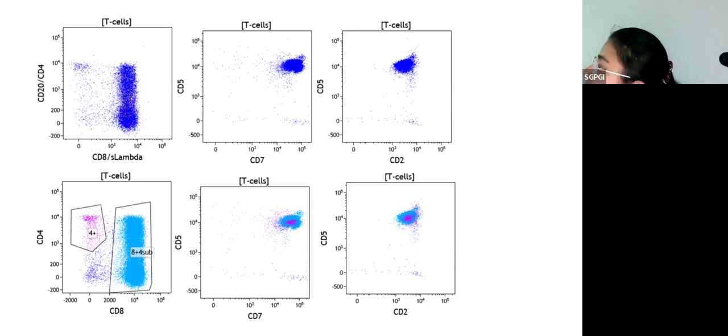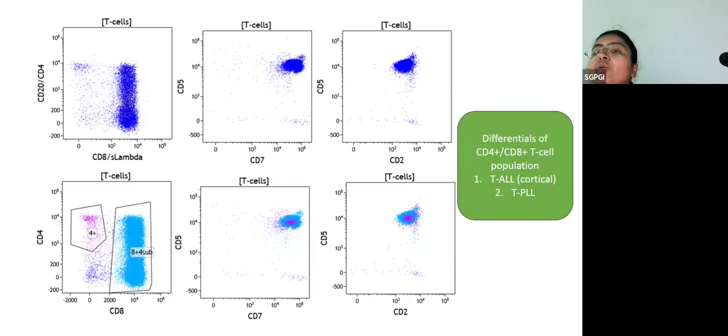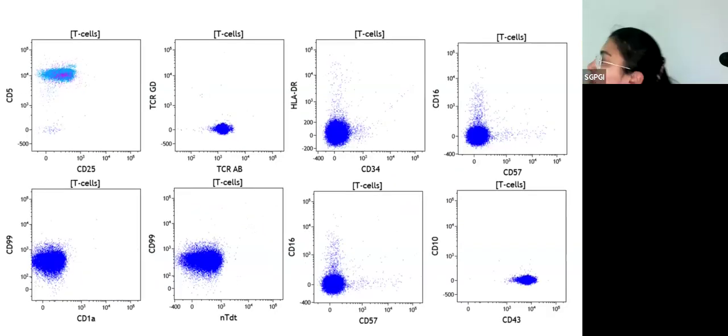What about CD4 and CD8 on the T cells? They appear to be CD8 positive, but there is definitely a subpopulation that is co-expressing CD4. These particular cells, the CD4 positive as well as the CD8 positive population, which expressed or did not express CD4, everything was gated and you see that CD2 and CD5 are nicely positive. Differentials of CD4 positive, CD8 positive population are T-PLL and T-ALL. We tried to rule out T-ALL. You look at CD99, CD10, TdT, everything appears to be negative. These cells expressed TCR alpha beta. They were also negative for CD34 as well as HLA-DR.